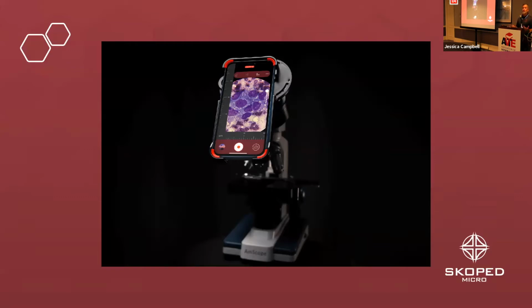We make 23 millimeters and 30 millimeters. That would have meant nothing to me many years ago, but there are essentially two eyepieces that every microscope uses, 30s or 23s, and we make them both. So that's no problem for us.